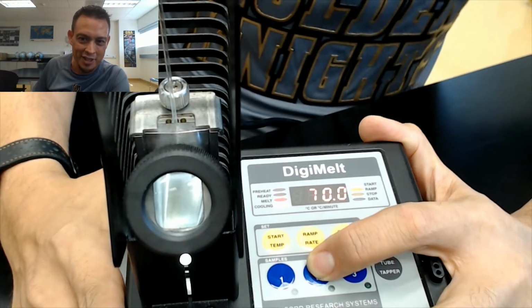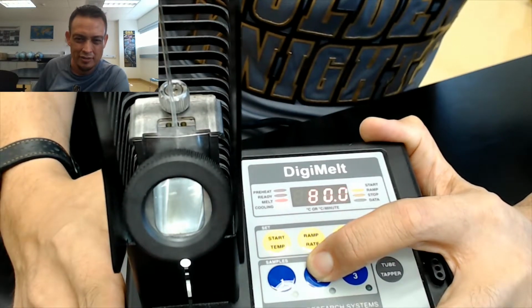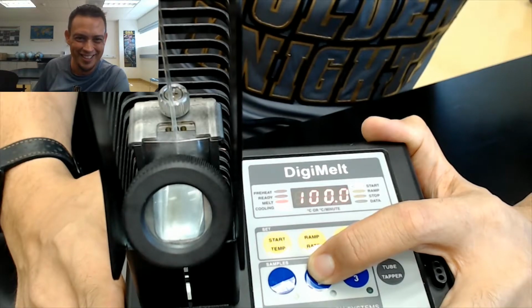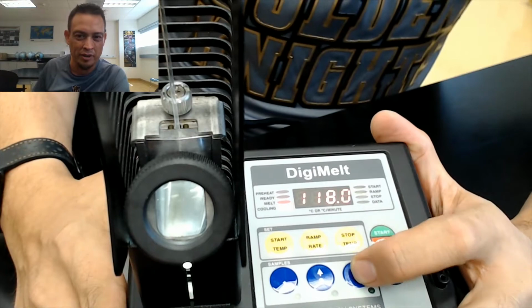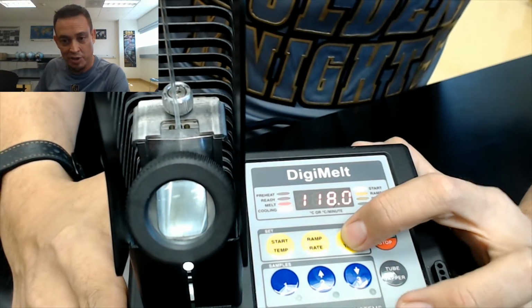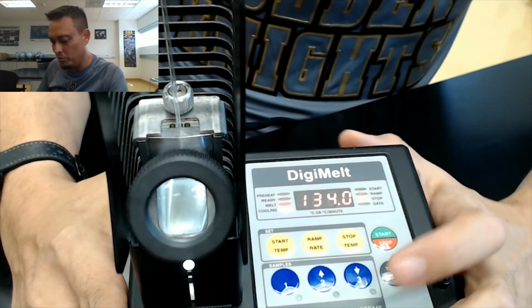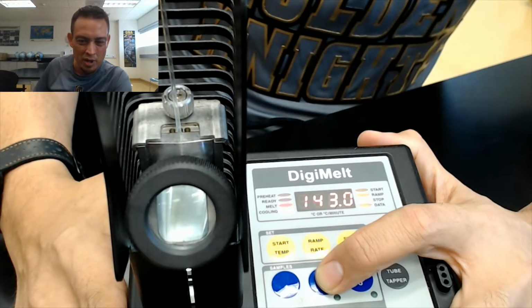Oh, I just said 15, right? So let's go 118. You can hold it for it to go faster, or just be patient with it. Oh, it started jumping in 5s after I held it for a while. All right, so there's your start temperature. And then your stop temperature just needs to be somewhere above the melting point. So I like to go with the 10 degrees I said. So let's go to 143.